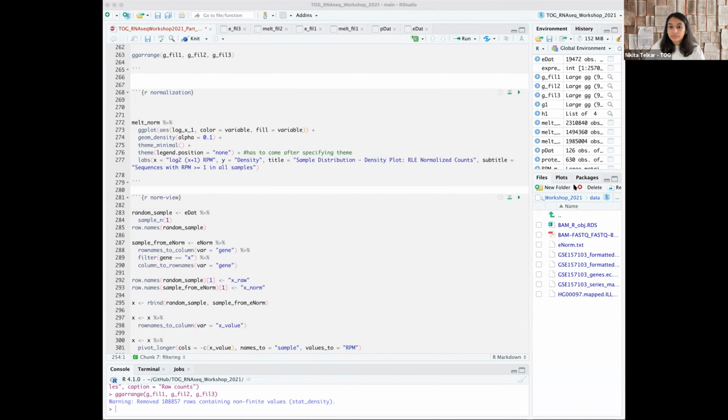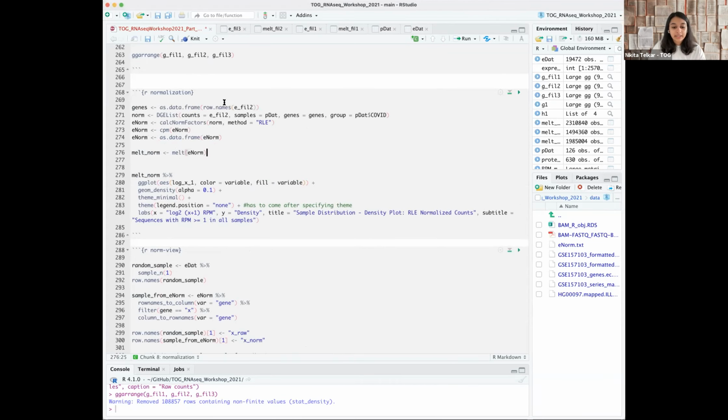Basically, normalization is what you perform when you want to scale all of your data. Sometimes there are going to be samples that have extremely high expression, and some samples are going to have low expression. How are you going to compare these? Maybe a sample for one patient was taken after dinner, one was taken before dinner.